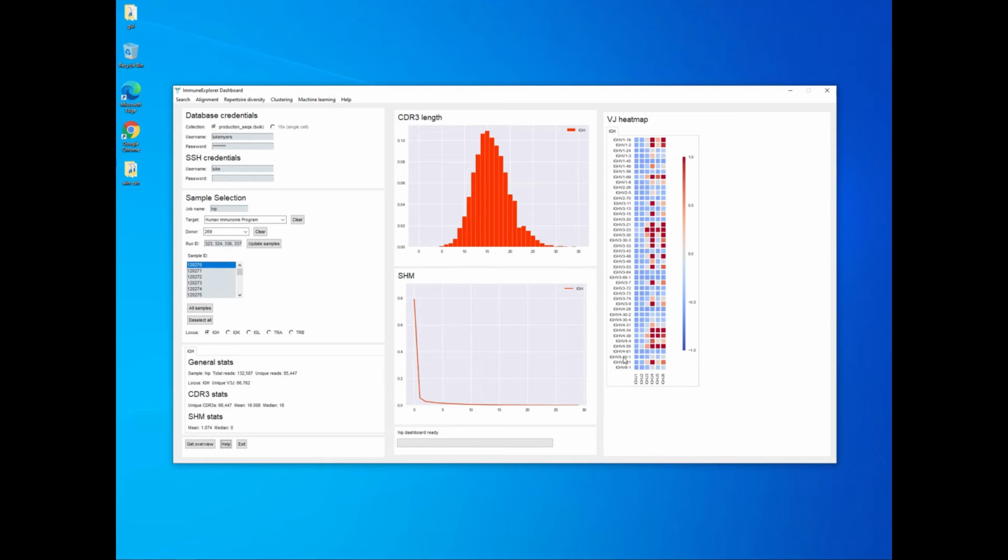And the plots come back in a few different flavors. We're looking at here the low resolution copy. We've also got a high resolution raster graphics version and a vector version that should be fully editable in your favorite program, whether that be Inkscape, Illustrator, or something else entirely.